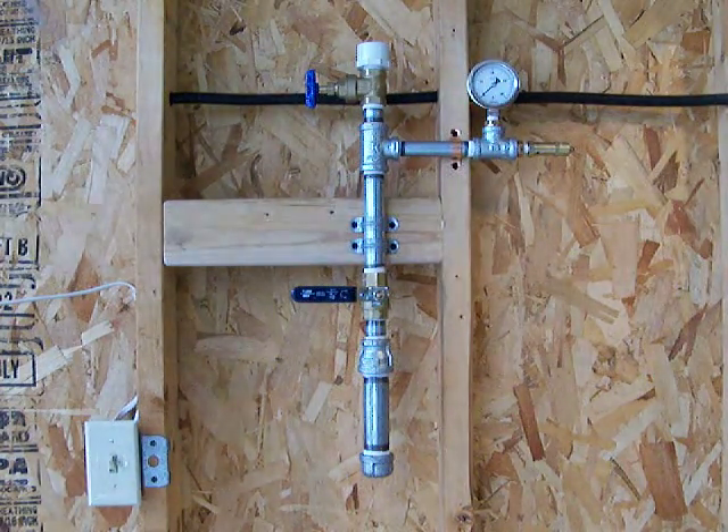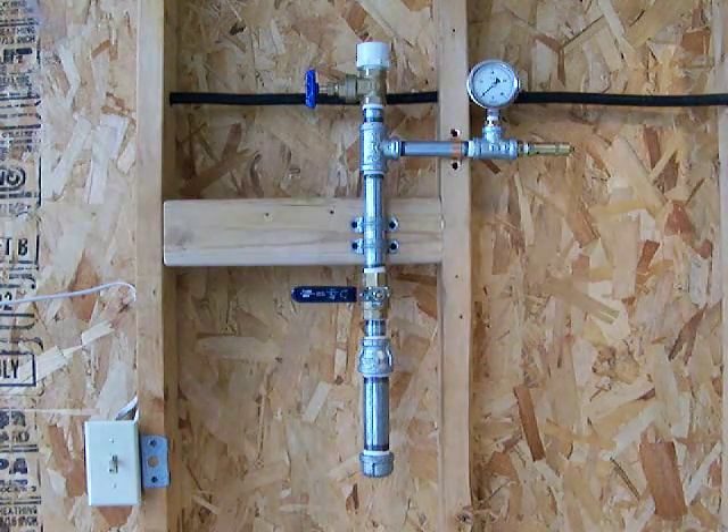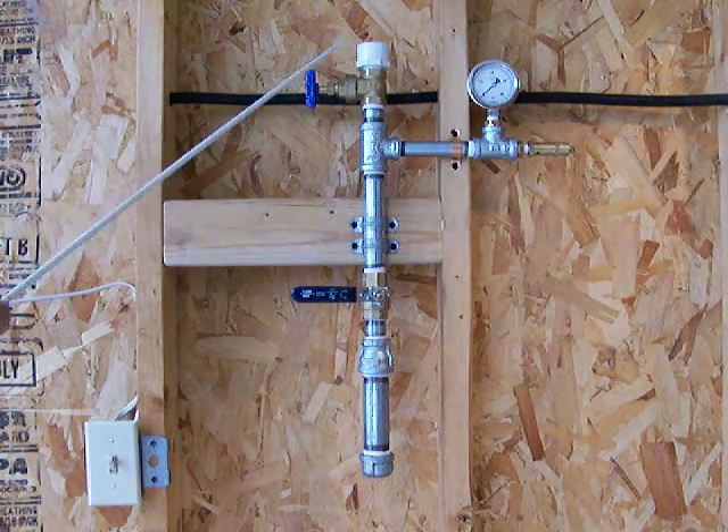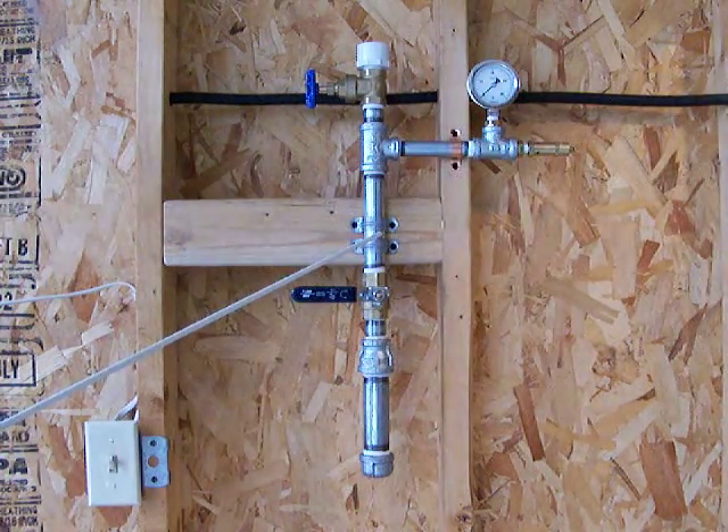I built this device to test the pressures of hydrogen peroxide. I put 50 milliliters, which is about a shot glass, of 35% hydrogen peroxide in here. I closed this valve. The hydrogen peroxide is sitting right here.